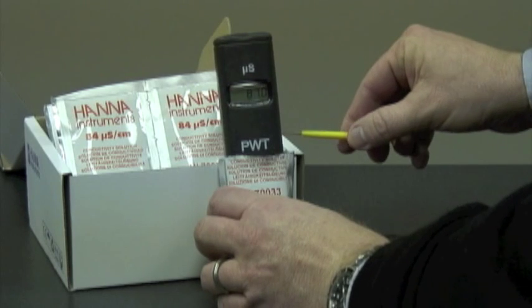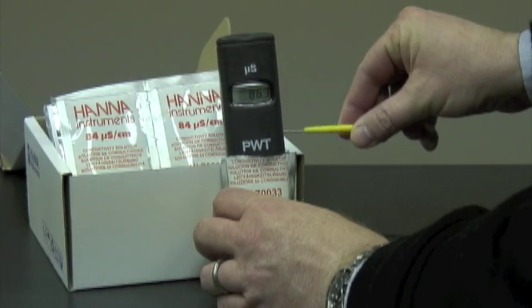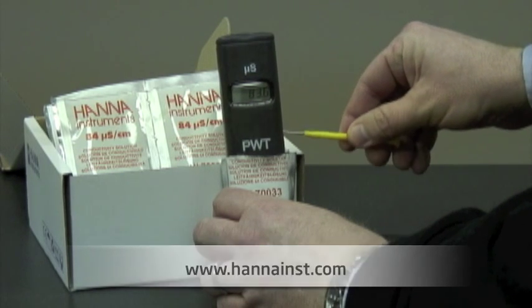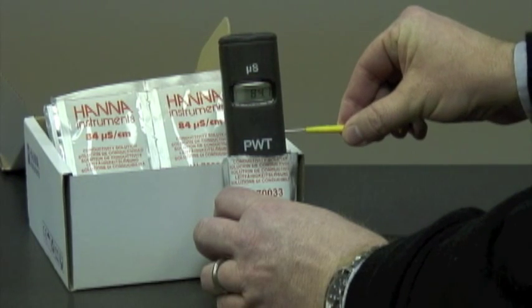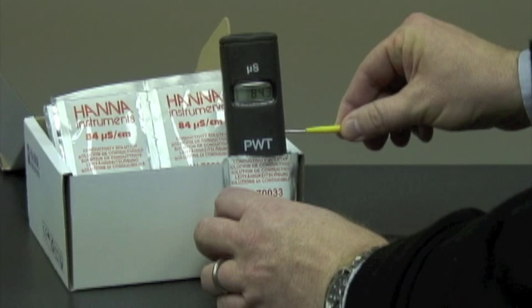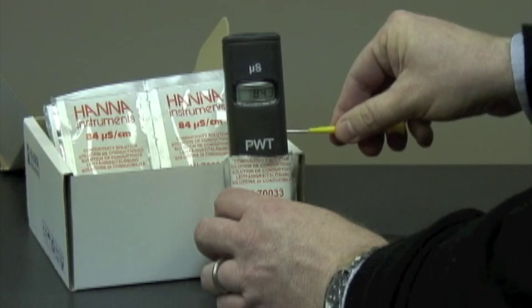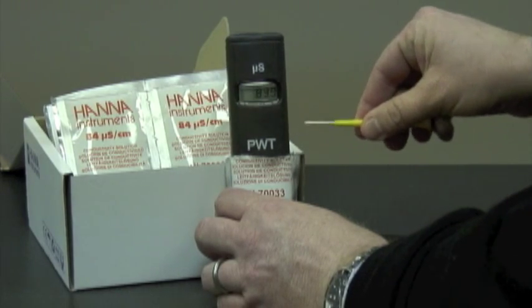What we do here is we adjust the trimmer to 84. And now we are ready to measure.